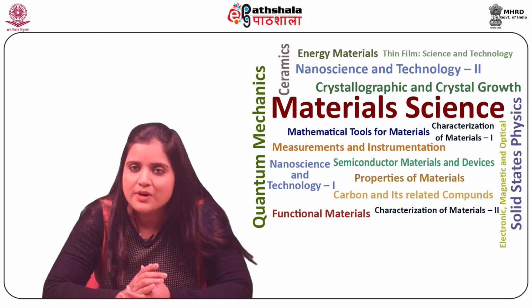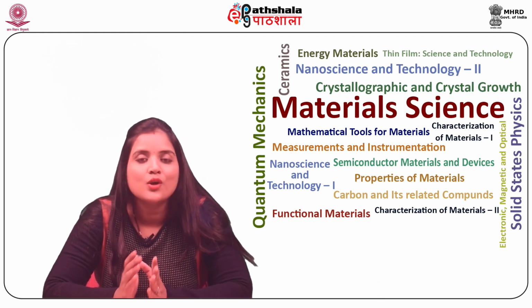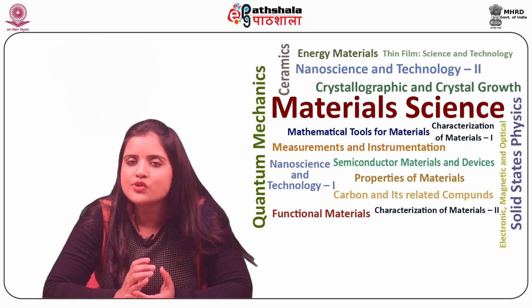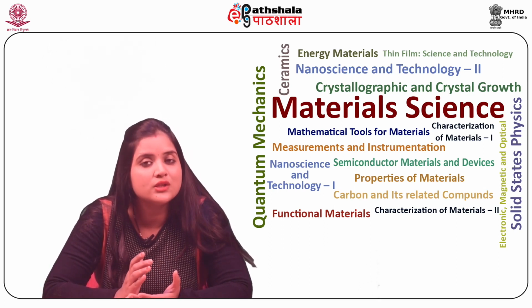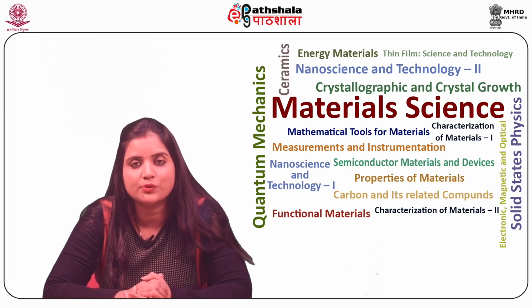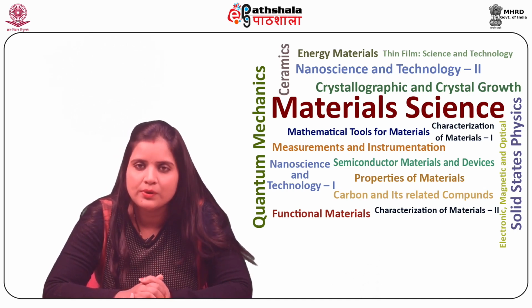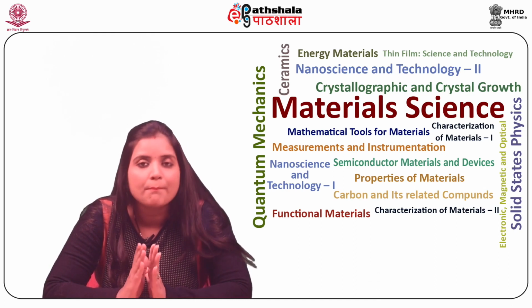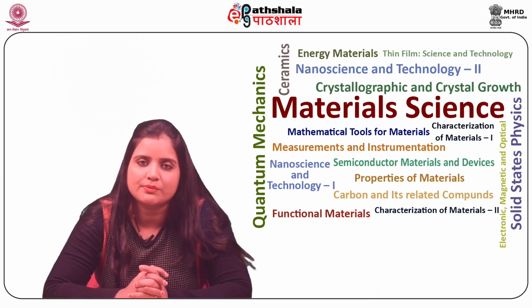STM can be operated in a wide temperature range from 0 Kelvin to a few hundred Celsius. Lateral resolutions of the order of 0.1 nanometer and depth resolution of 0.01 nanometer can be obtained using scanning tunneling microscopy. Another advantage of scanning tunneling microscopy is that the atomic arrangement on the surface can be obtained by measuring the DOS of the surface atoms.